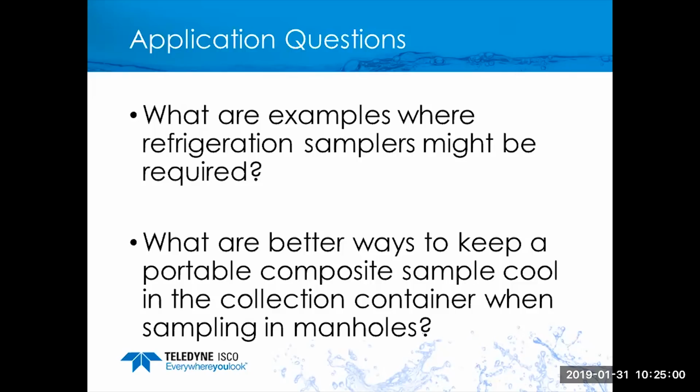sample. More and more often I've run into and experienced where folks are using gel packs. One, they're less messy. They don't melt and leave a lot of water that is collected in the base. They can just be pulled out, put back in a freezer, and then be reused. So that's a very big advantage and recommended practice that I've been passing on.